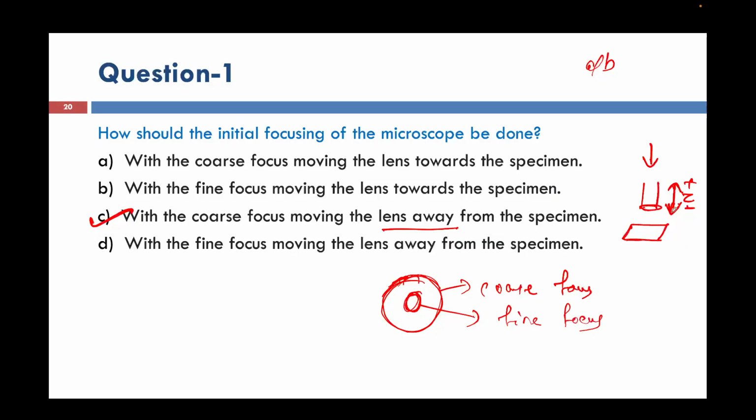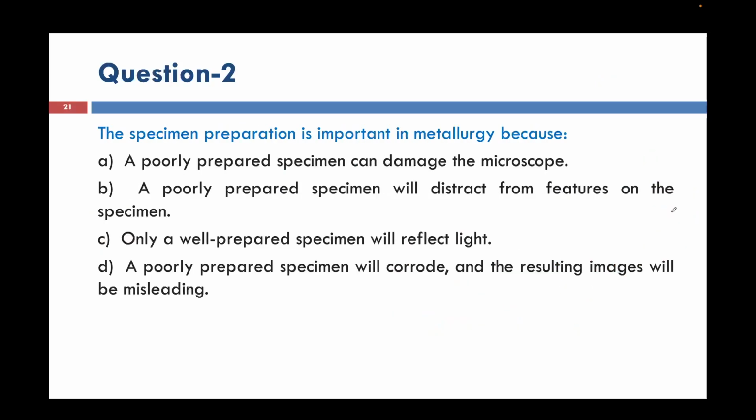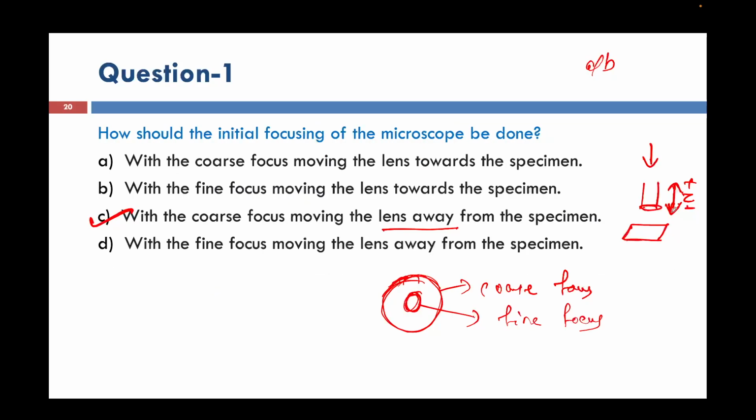Okay, and this. Excuse me? Yeah. Please go to question 1. Yes, this is applicable when you have the vertical microscope. This is not applicable when you have the inverted microscope. Can you see question 1? Two types of microscope, correct? One is vertical and another is the inverted microscope, correct?